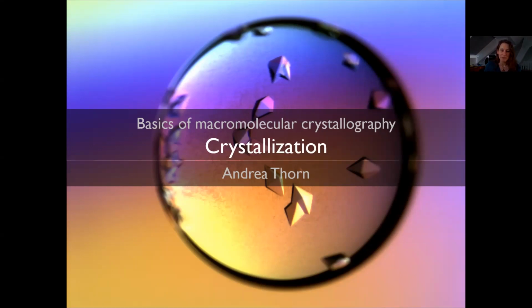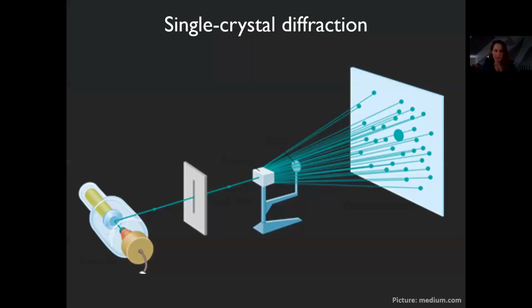But today we are first going to talk about how we can get those crystals. And that is really the bottleneck of all of crystallization. I'm quickly showing you the experiment. We'll talk more about this in later lectures.